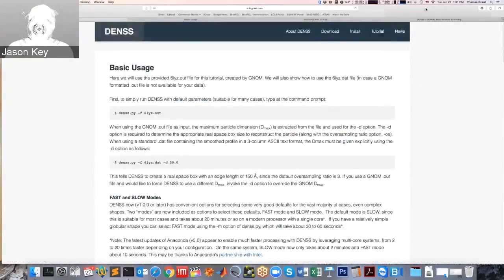I had a couple of questions. I guess one, just thoughts, not even questions really, but I was thinking about orienting the models within these envelopes, and I was wondering, if you've got a cofactor, or you happen to have some heavy atoms or some selenomethionine protein lying around that you happen to use, is that something you've looked at? Is it advantageous? Does it make a difference?